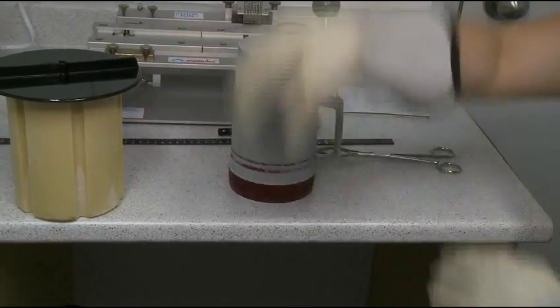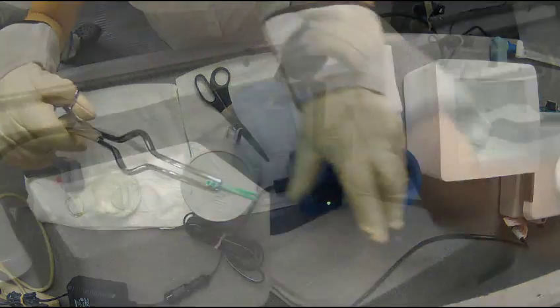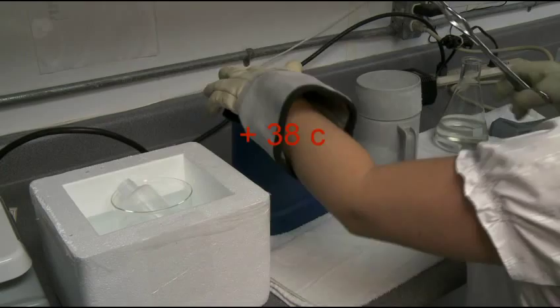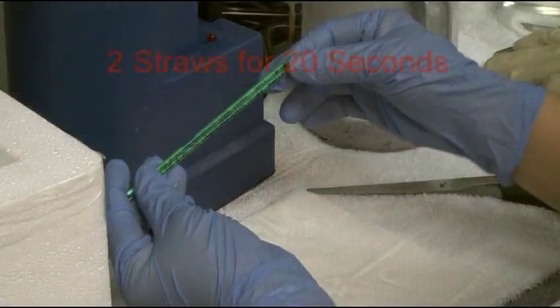Remove two straws from the nitrogen storage container and immediately transfer the straws to the thaw unit at plus 38 degrees Celsius. Thaw semen straws for 20 seconds and remove.